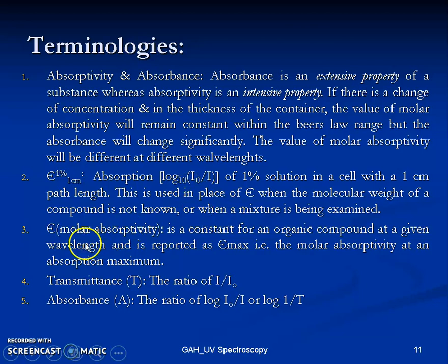And epsilon, as I just mentioned, the molar absorptivity, is constant for an organic compound at a given wavelength and is reported as epsilon max, that is, the molar absorptivity at an absorption maximum. We will be employing these two terms in the practicals.